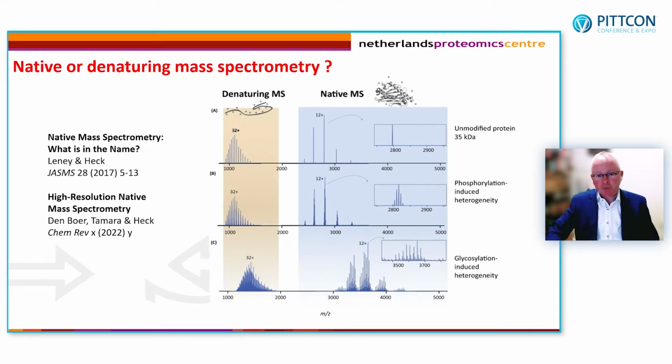Normally, when we do mass spectrometry and biomolecular mass spectrometry, we often couple it to liquid chromatography. But liquid chromatography, as beautiful as it is, often occurs in a fluid that contains an organic, like acetonitrile, and it's often also acidified by formic acid or something else. And the consequence is that the proteins that you analyze by LC-MS really get denatured.